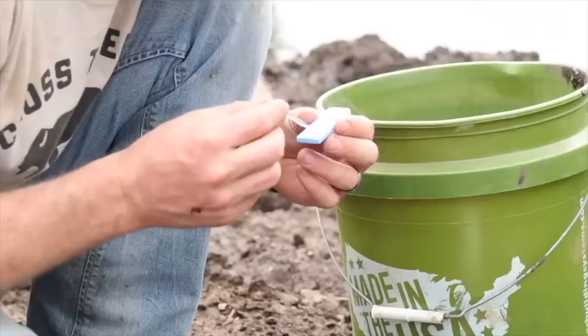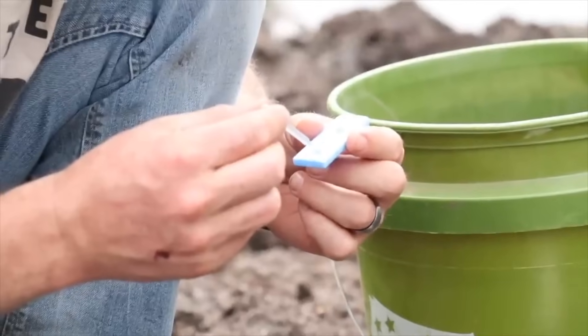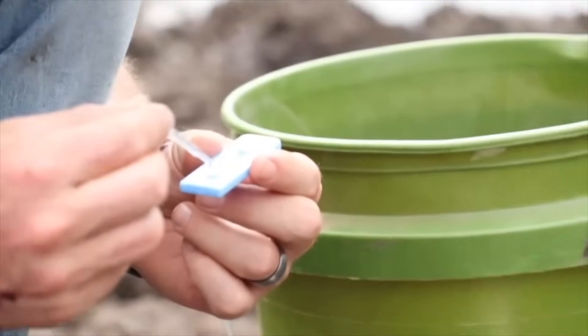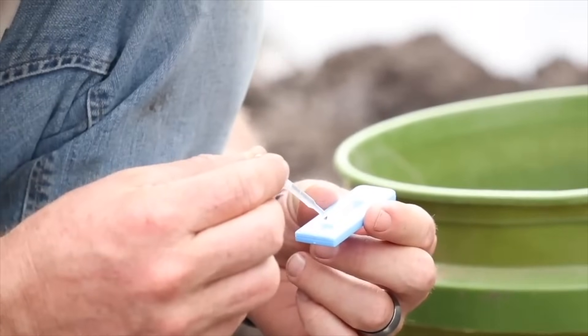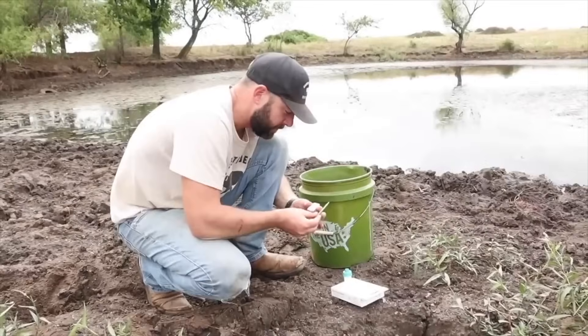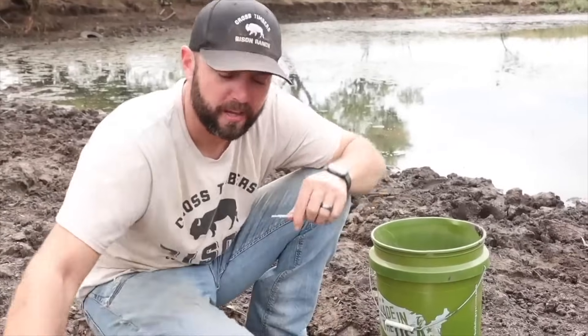Just a drop or two — do a couple. Three drops only. All right, put it down and wait eight minutes. It's already making moves.